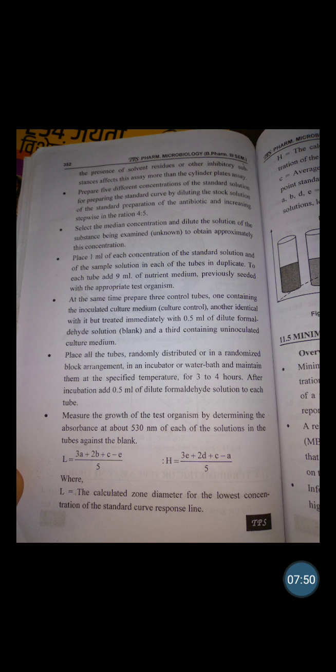But the presence of solvent residue or other inhibitory substances affects the assay more than the cylinder plate assay. Then in this method, first prepare 5 different concentrations of standard solution for preparing the standard curve, by diluting the stock solution of the standard preparation of the antibiotic in a stepwise ratio, that is 4:5.